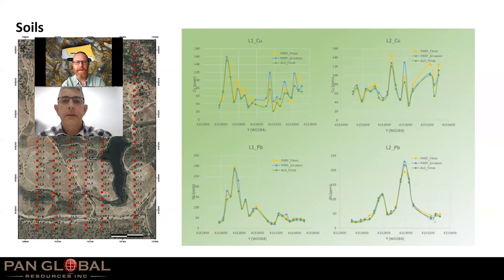And so moving forward, after doing this orientation survey, you decided you're happy with the data directly through the bags on sieved less than 1 mil material for the transition metals, base metals? That's right. Yeah, okay.